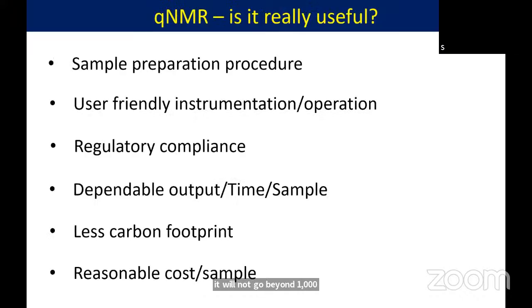So friends, this is the way qNMR is now emerging as a popular technique in analysis of especially complex mixtures. For example, you have a plant extract like Rauwolfia serpentina extract. I wanted to know how much quantity of reserpine and its congeners are there. Then qNMR can straight away give you the answer.